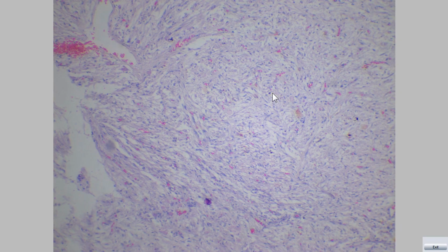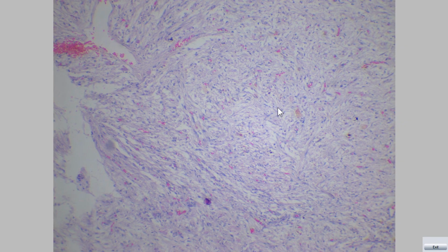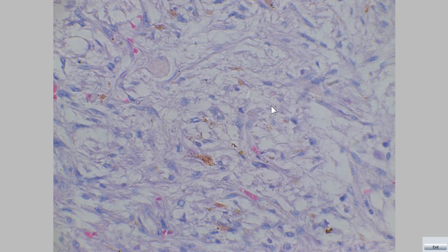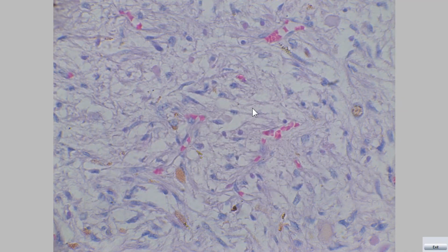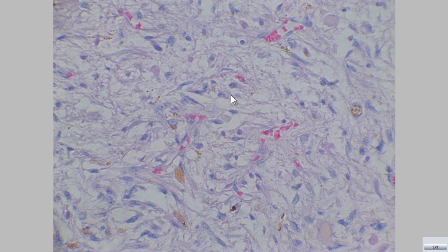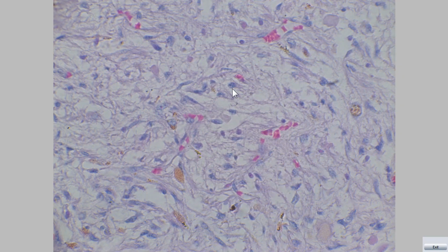The main component of this region is the presence of glial cells called pituicytes. These cells are called pituicytes, that resemble astrocytes.